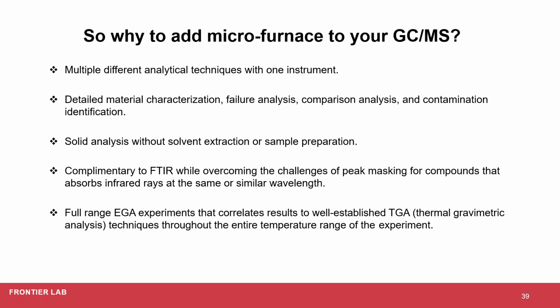Also, this technology can be used for detailed material characterization, failure analysis, comparison analysis, and contamination identification. And I'm hoping that by showing you a couple of real-world samples, you get a feeling of how this technique can be applied for these kinds of contamination and reverse engineering analysis. Also, virtually any material, including insoluble solids, can be analyzed without any solvent or sample preparation.